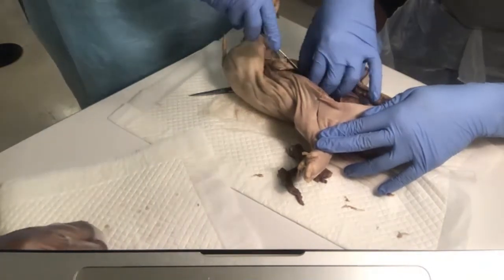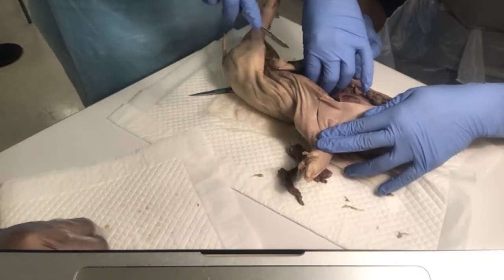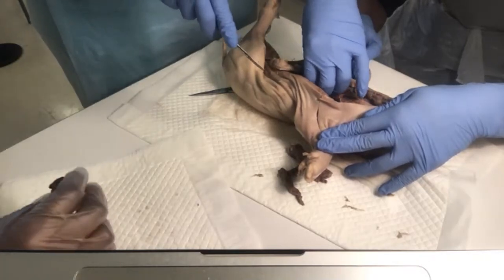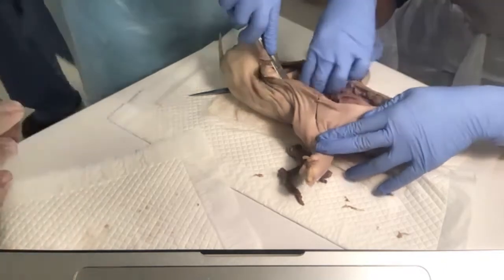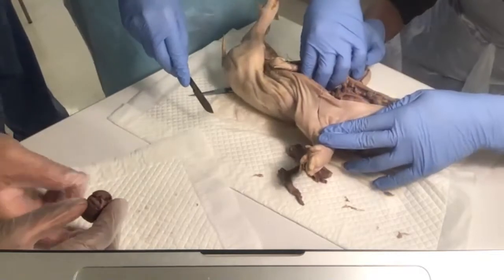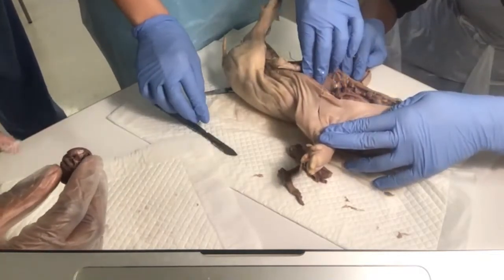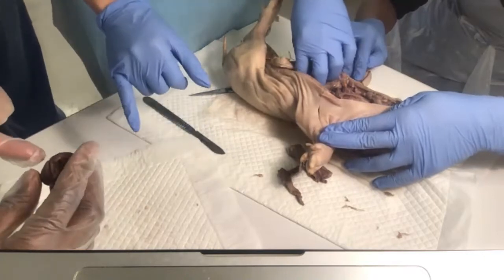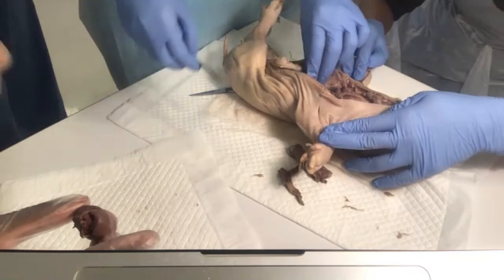The thing on the tip, what is that called? The apex. So there's a line or a sulcus that's going to be going across. Now, what is also in the front? Remember your atrium? So that's how you know the front. And you see the interventricular sulcus? It's going diagonal. So that's how you know your front. And then you turn it on the back.